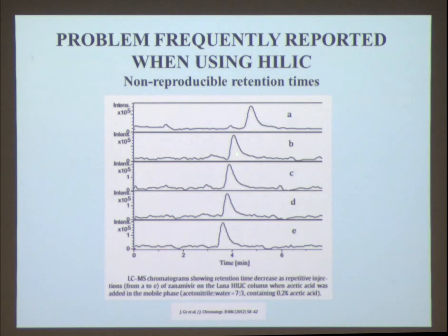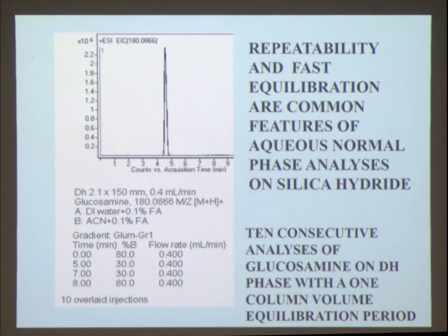And they can see that as time changed, the water layer was very, very slowly equilibrating, and it took a long, long time, and they still were not getting reproducible retention times. It's a very frequently reported phenomenon in HILIC, but not us.